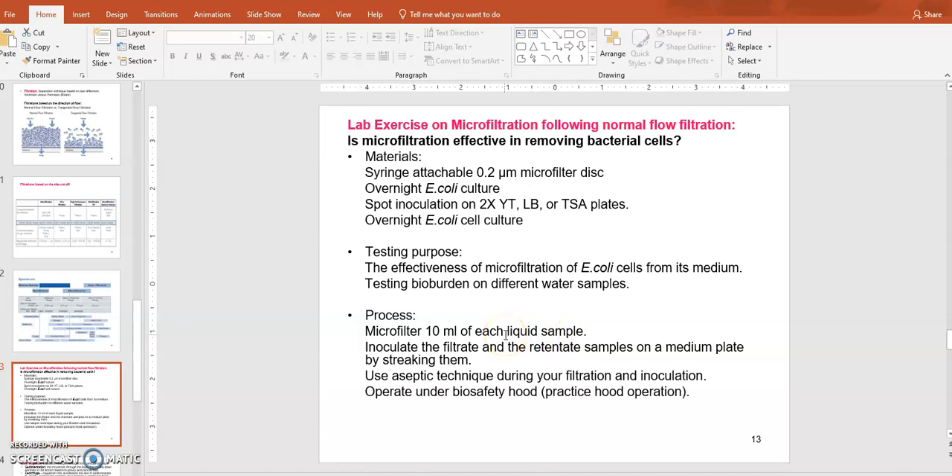You will micro filter about 10 milliliters of liquid sample that may have E. coli cells in it. Once filtration is done, the filtrate — the liquid that has gone through the filter — should not have any cells. You will test this by streaking some of the filtrate onto a petri dish plate and growing them. Also, scrape some of the retentate captured in the disc filter, streak it on a plate, and see if you can see cells. That is the aseptic microfiltration of E. coli cells lab exercise — streak the retentate and permeate, that is lab exercise two.